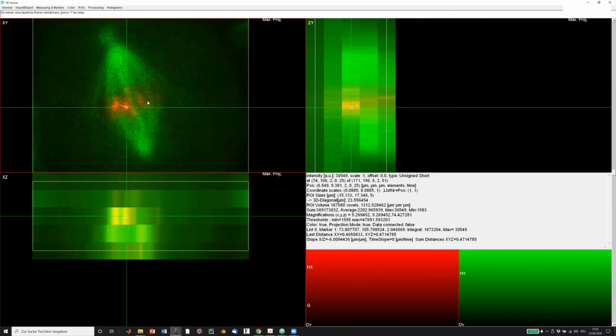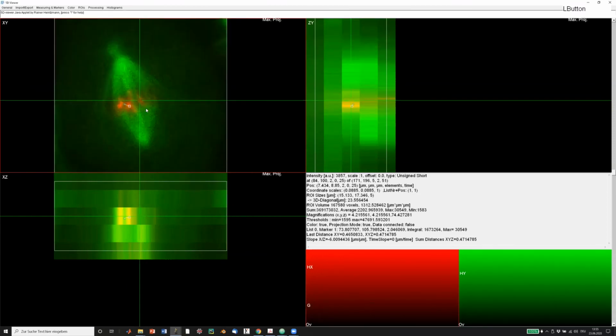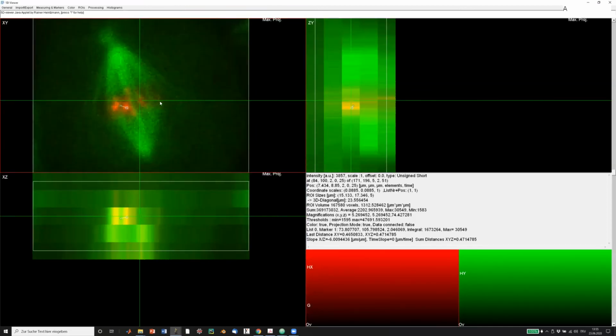generating nice multicolor overview false color data of fluorescence lifetime images. You can do it to generate up to 3-dimensional histograms of your data from the color channels, and so on and so on. So I hope you enjoyed this tutorial, and I hope you'll be watching some more of the more detailed tutorials on how to use View5d in Fiji, ImageJ, and other programs.